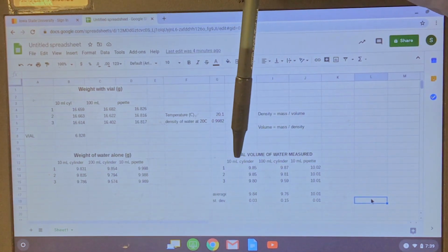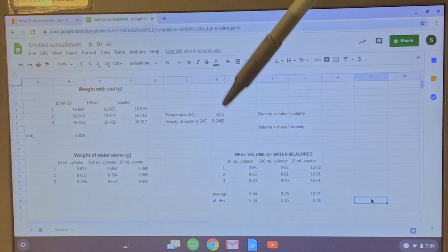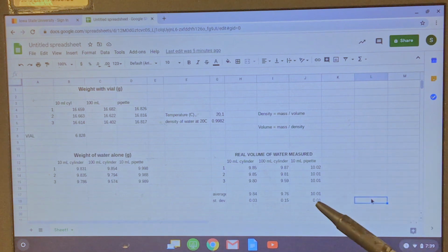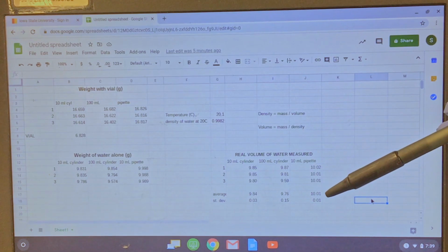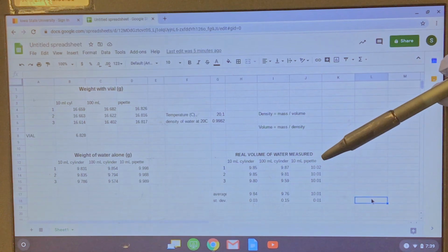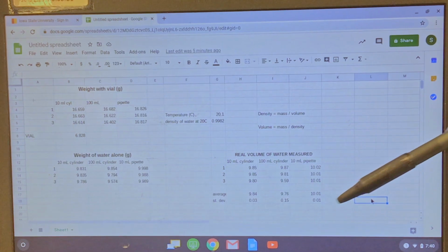So as you can see, the 10 milliliters of water that I measured appear here. Okay, so 10.01 milliliters is the volume that I measured on average using the 10 milliliter graduated pipette, with a standard deviation of 0.01.